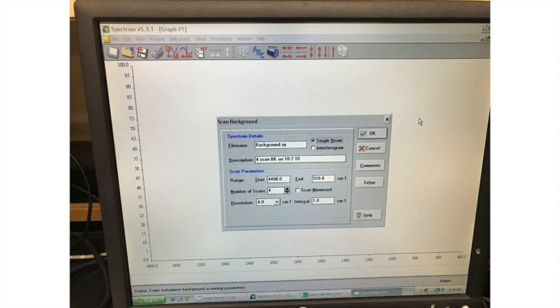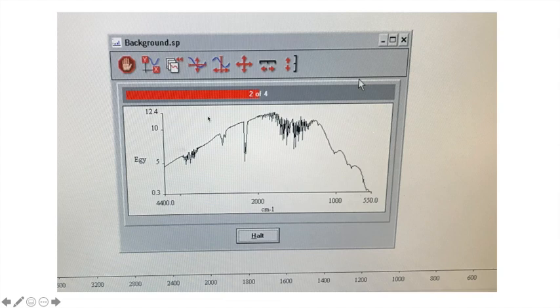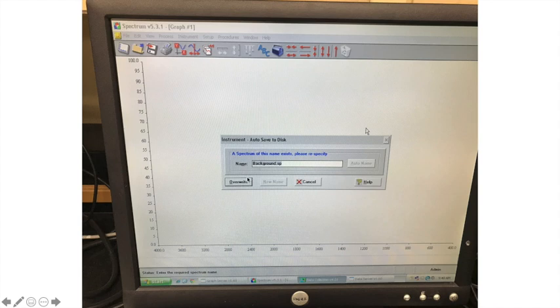Okay, so here we are back at the IR. We're gonna take a background. So click OK. Okay, it's taking the background. 2 of 4 scans ready. Looking like our normal background, right? Oh, there it is. It's done with the 4 scans. We can overwrite the old background. So we're going to use this current day's background scan and not the one from whoever ran the background last.